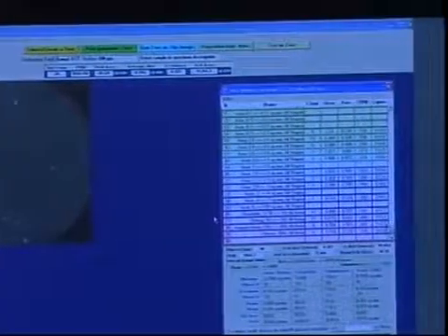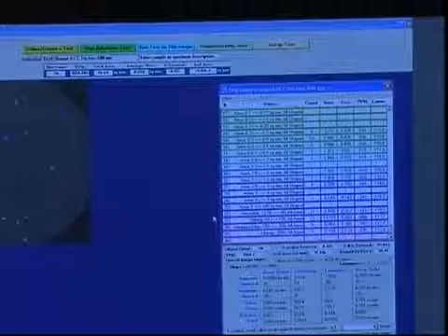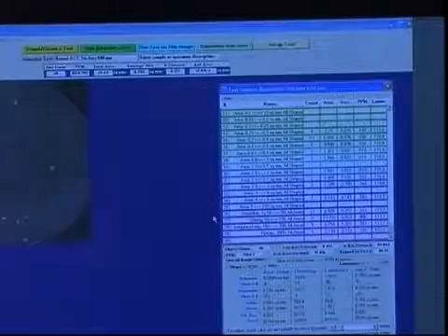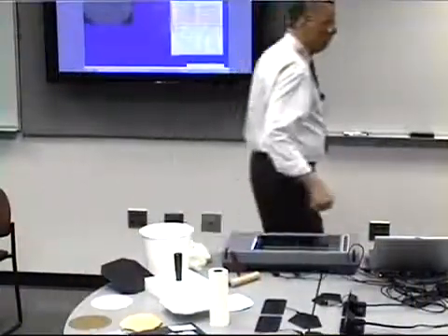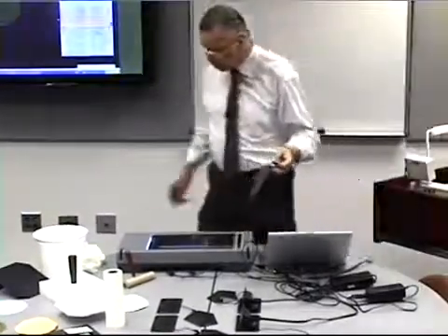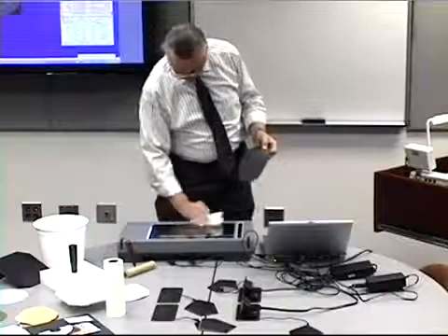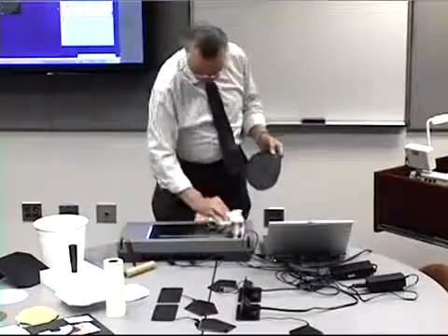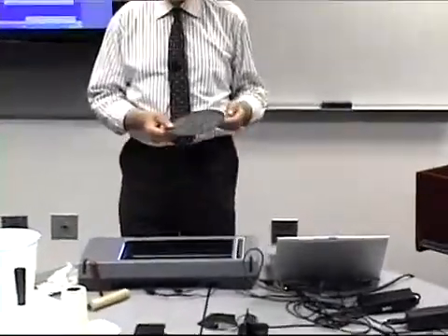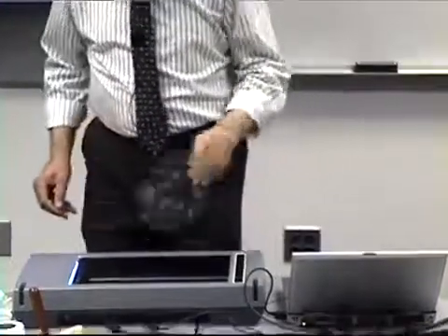Very simple, very straightforward. I want to show you now the method for measuring the black hand sheet from the Pulmac device. This hand sheet is a very busy hand sheet. A lot of things going on here. We have fibers present. We have the white stickies, and we have the hairy stickies. And for those who are unfamiliar with hairy stickies, they're the stickies that are stuck to fibers and sometimes cause problems in the process. I can see these hairy stickies, and I will show you an example of them.